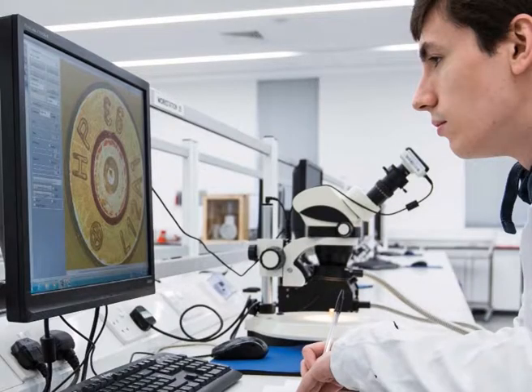A firearm forensic expert then examines each potential match and makes the final determination whether a match actually exists or not. IBIS is similar to an internet search engine. In that case, it is nothing but a tool used to cull through vast amounts of information, and the user makes the ultimate decision whether the search engine has produced the correct results or not.